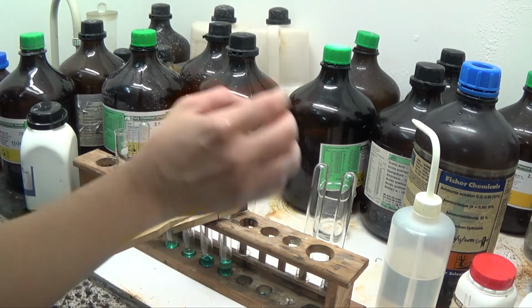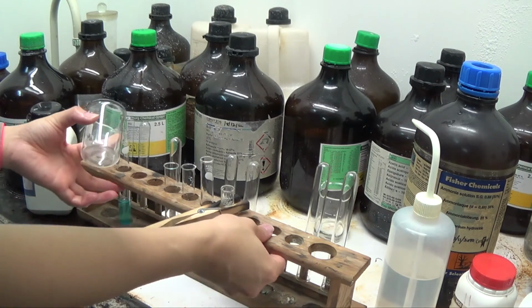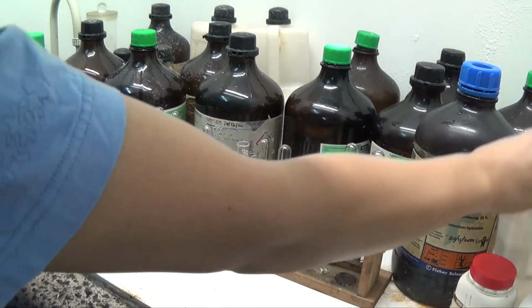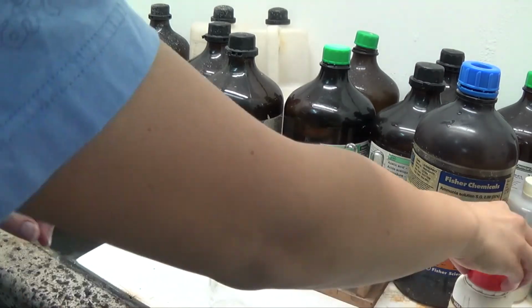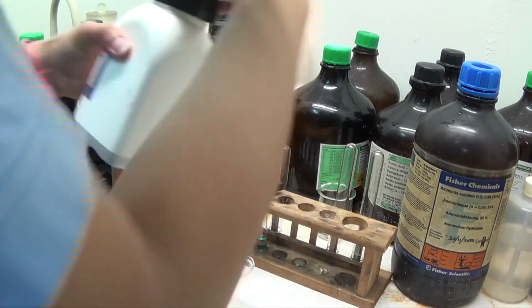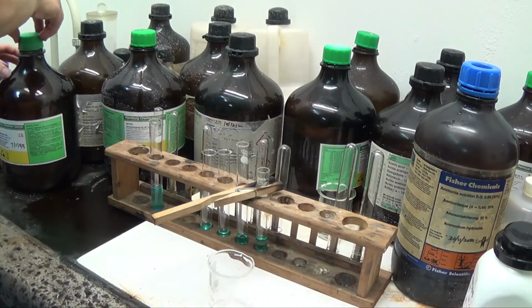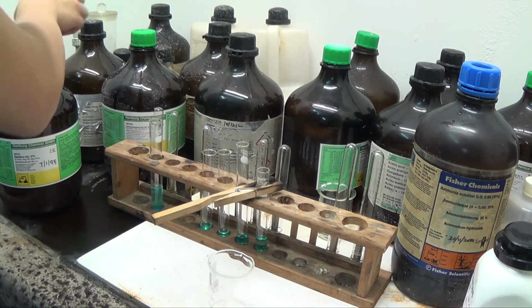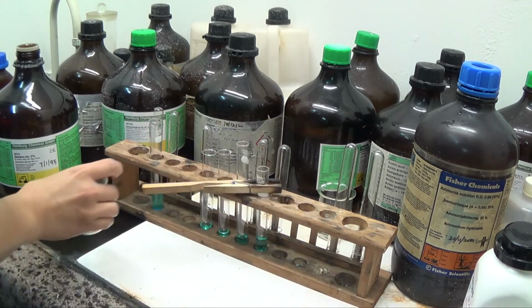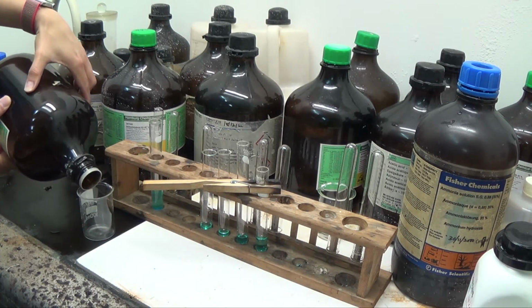I will just pour out another beaker of the concentrated hydrochloric acid, because hydrochloric acid does actually give off the HCl fumes pretty rapidly. So if they have been stored in the cabinet for a long time, they're not going to be very concentrated anymore. So I don't need a lot, I just need a little bit.